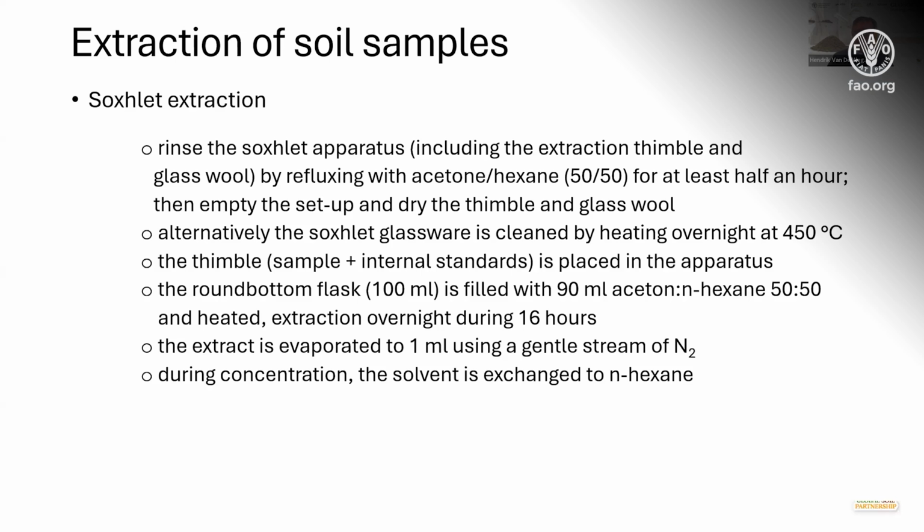After that, we will evaporate the solvent. So we concentrate the extract to 1 milliliter using a gentle stream of nitrogen. And during concentration, the solvent is exchanged to n-hexane.